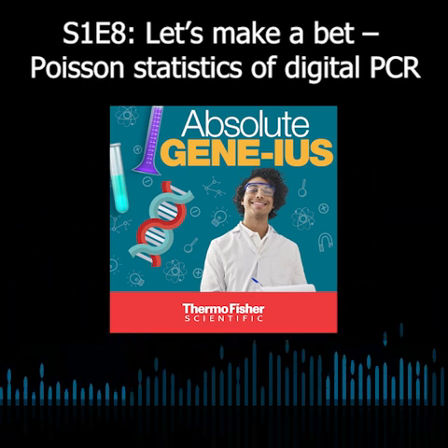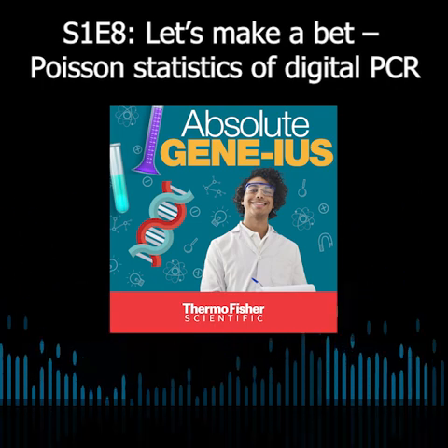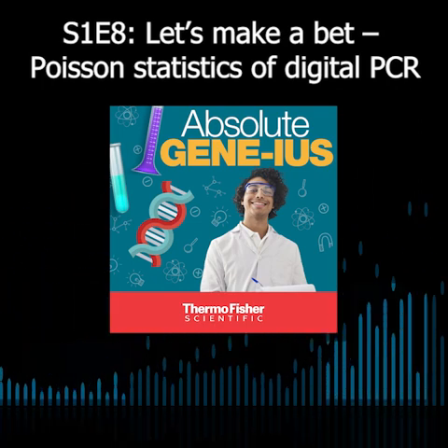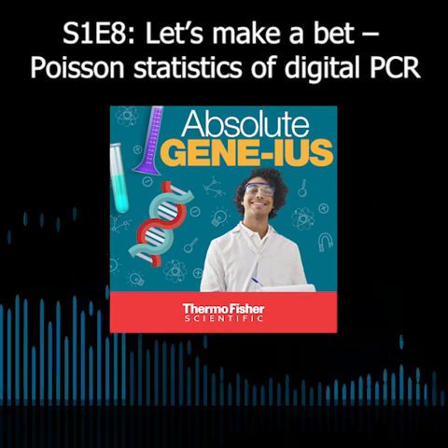This brings up a really interesting point, thinking about how digital PCR works. What problems could digital PCR allow you to solve, maybe even better than qPCR, real-time PCR?